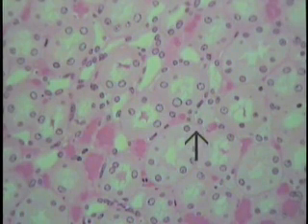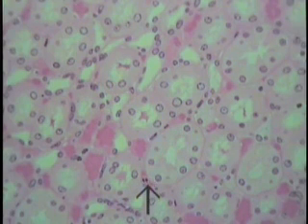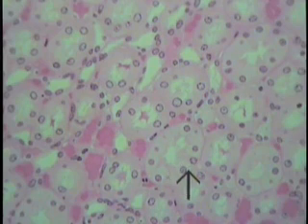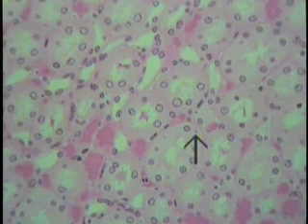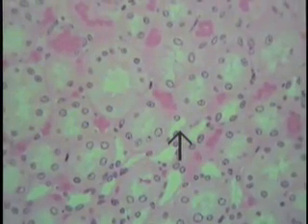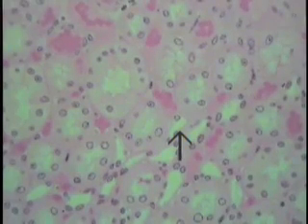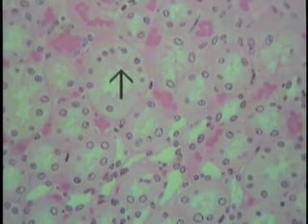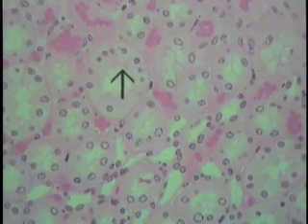In the same field, one gets an opportunity to compare it with another tubule. In this particular case, you can see that the height is much greater than the width, and so these would be an example of simple columnar type of epithelial cells. Move around within the medulla and identify several tubules lined by these various types of epithelia. This larger tubule, as I move the field just slightly, perhaps gives a better profile of what a true simple columnar looks like.